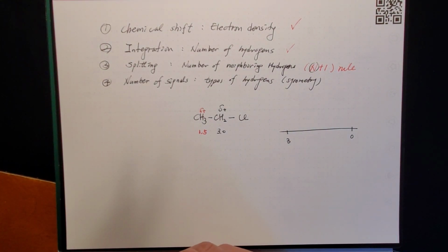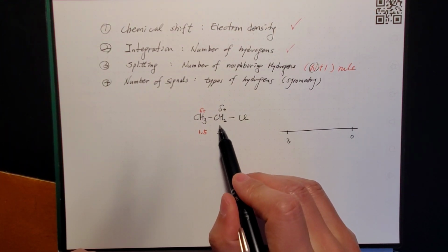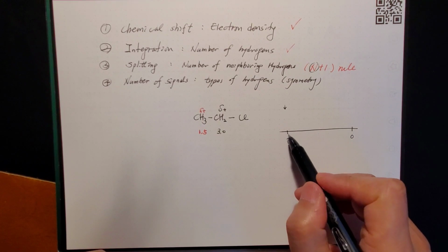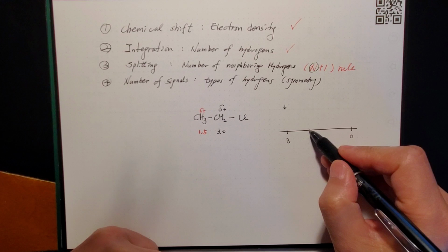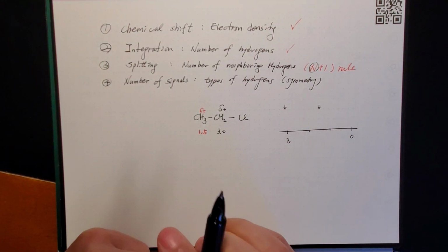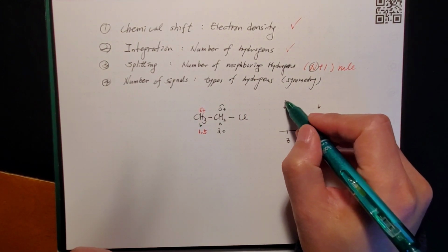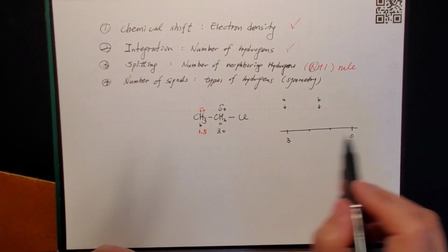Okay, so you are expecting this hydrogen to give a signal around here, 3. Normally it's like a 3.2 or 3, but let's just say 3.0 ppm, and about 1.5-ish you expect another peak. Okay, let's label it hydrogen A, hydrogen B, hydrogen A, hydrogen B. So you know the chemical shift.